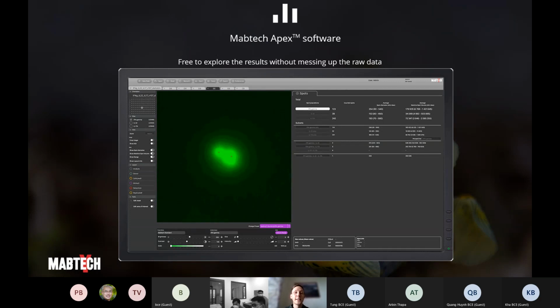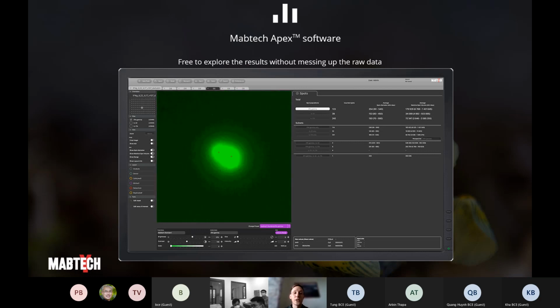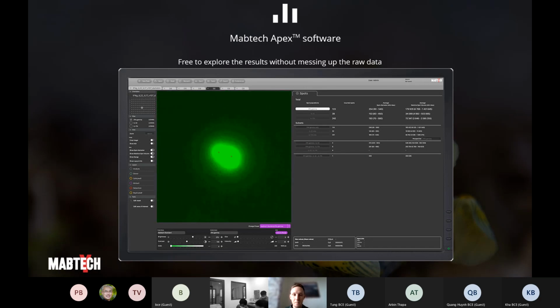It's a nice way of working in the system, and it looks nice, and it's easy and quick to do the different actions that you want to do. So I'm sure that after the training on Monday, you will feel quite comfortable working with the software and how to change different settings and use different features, etc.